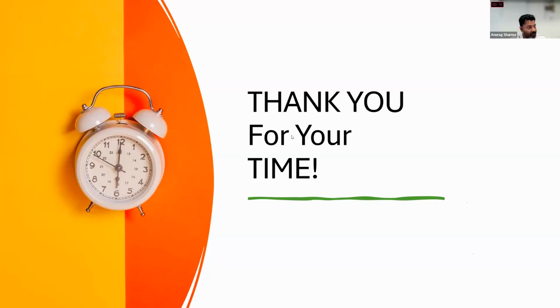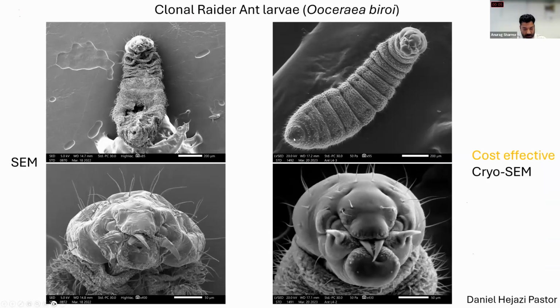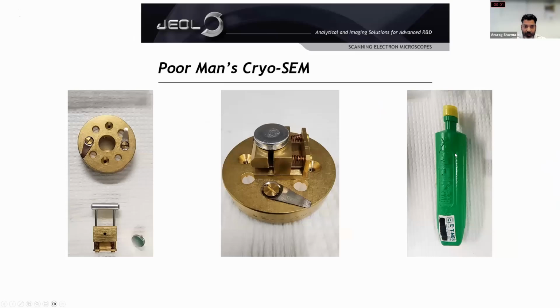Okay, so I will go back. The first question was the glue. You have to use the rice glue. This is very important, because this glue has a property to remain adhered on the surface even in the cryo conditions. We purchased Japanese rice glue from Amazon, but I guess you can buy any. You can take a picture of this and order it from Amazon.